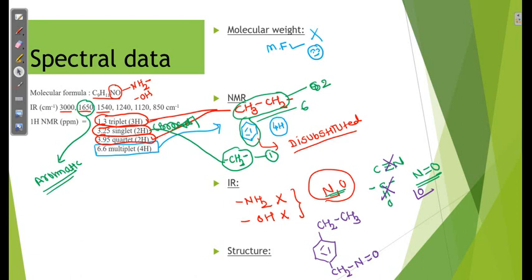If we have learned from the video on hybridizations, then based on that, the hybridization of this group is sp2. The sp2 hybridization is nearer to 1500 to 1700, these are approximate.